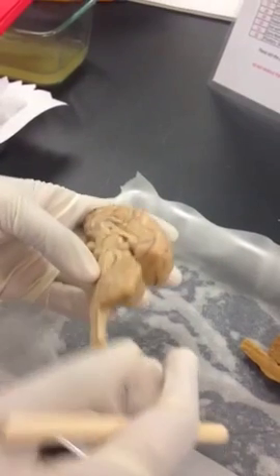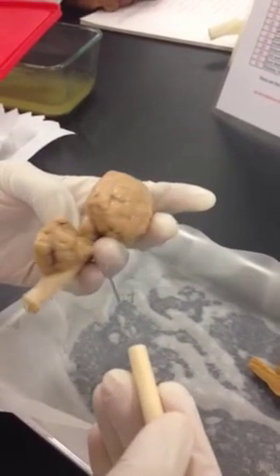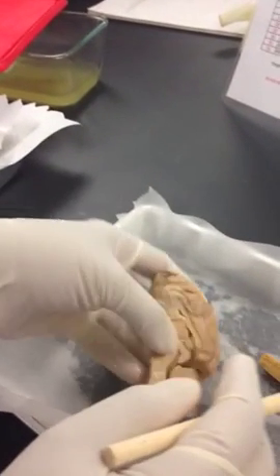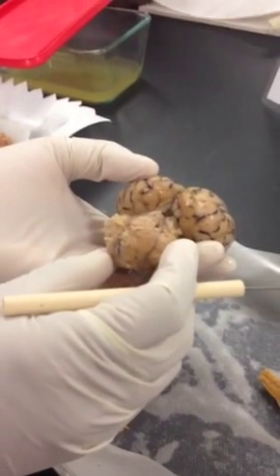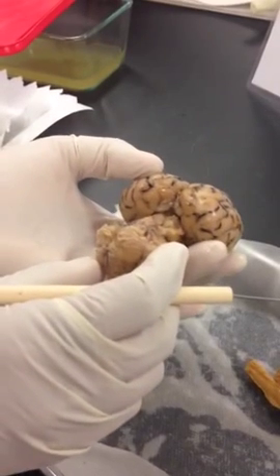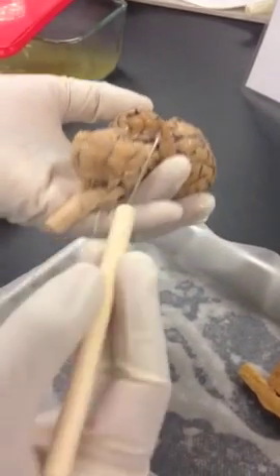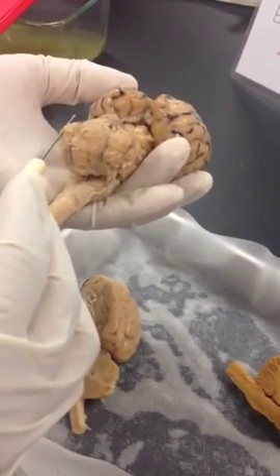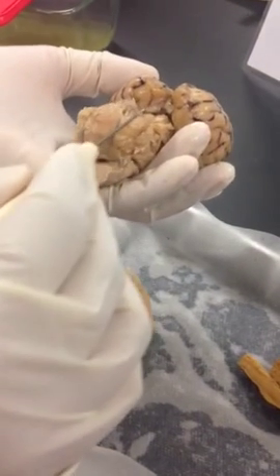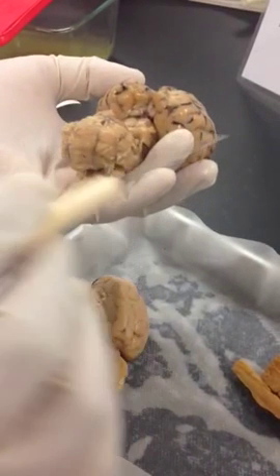Okay. Now let's look at the cerebellum. If you see on the outside, let's first look at the entire cerebellum. So your complete cerebellum looks like this. There should be a picture, the very first picture, where you can see the entire cerebellum. It has two hemispheres, right and left. You see the line that separates the two hemispheres, and in the middle you have another structure. We will come to that in a second.